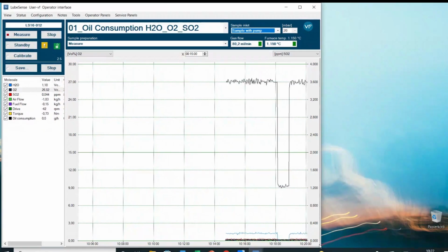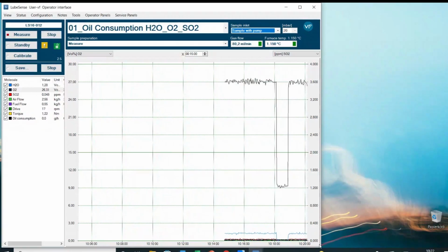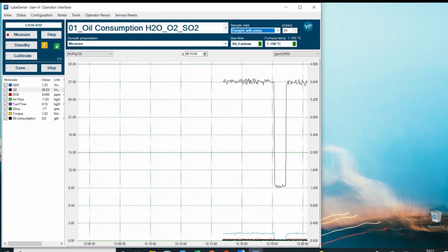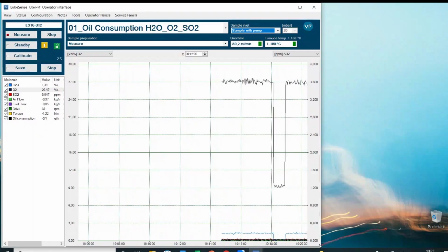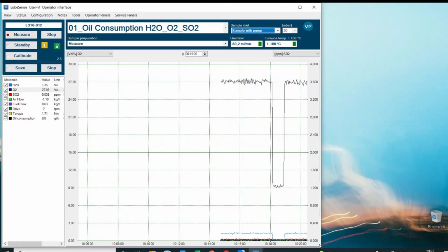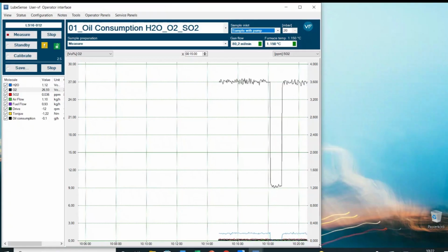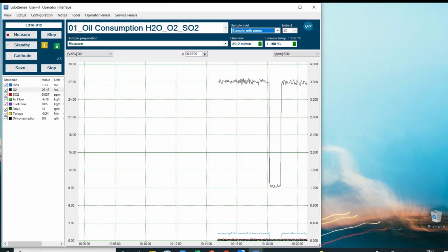So this is very important for the calibration procedure, which I will take this away. This is all completely automated. So during operation, you won't have to take care of this, but it is very important to calibrate the instrument by using the calibration gas also throughout the complete measurement system. So through the gas oxidizer and then into the mass spectrometer. So set this up like this.